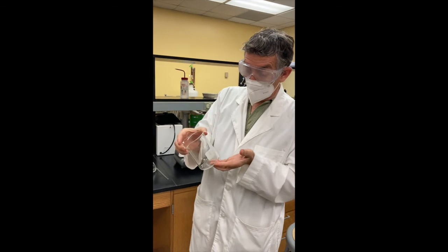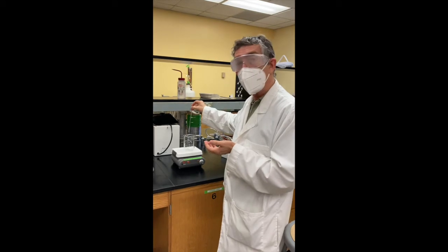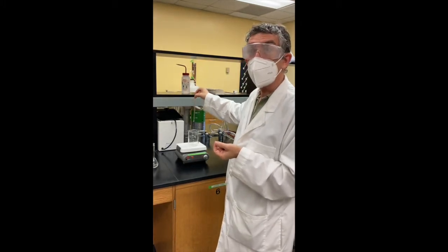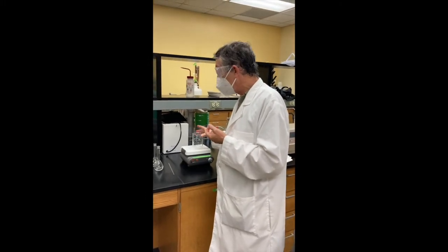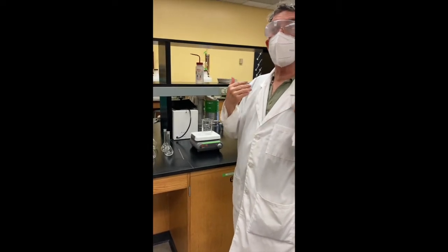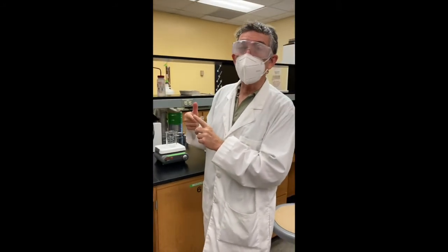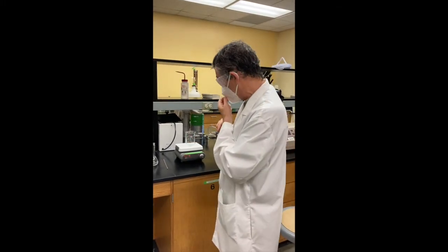So often people will not use a stir bar, and instead will simply stir with this glass rod. If you do use a stir bar, you'll have to be very careful that you get all of the polyvinyl alcohol off of it. One thing to remember as you do this experiment is that any residue of the solution, as it evaporates, will leave a film. And one thing, you can lose some polyvinyl alcohol in that film. And secondly, as we'll see shortly, that film can clog the instrument we use to measure the viscosity. There's a small bore, as you'll see.